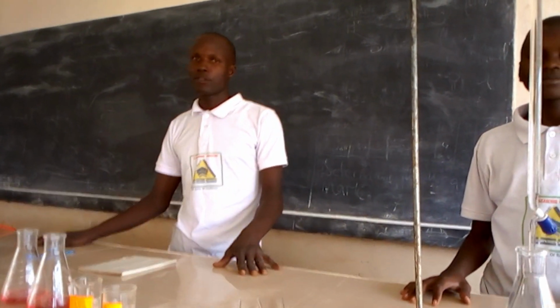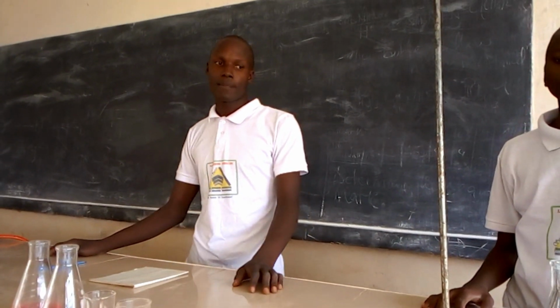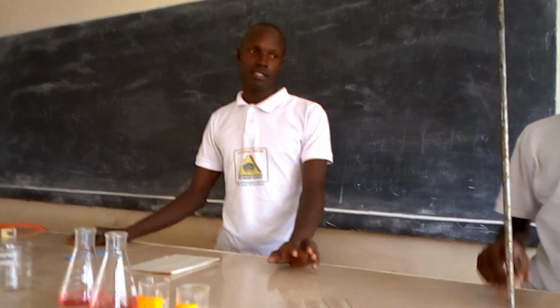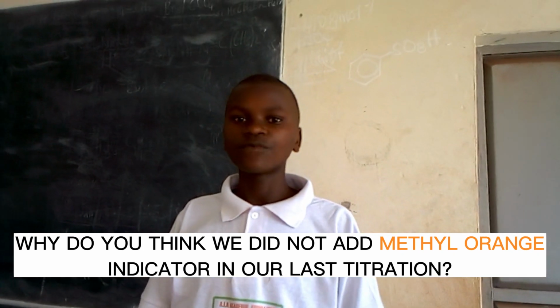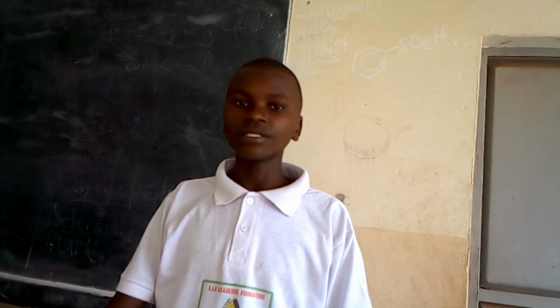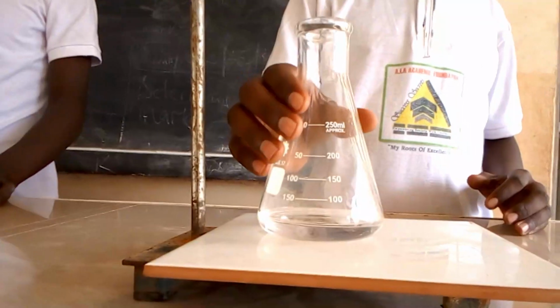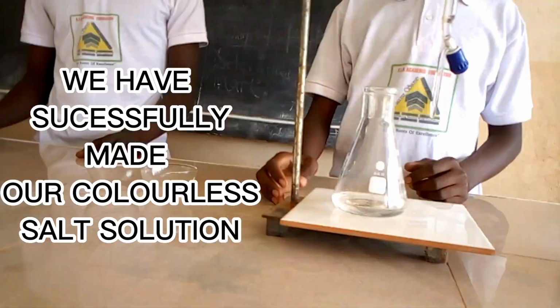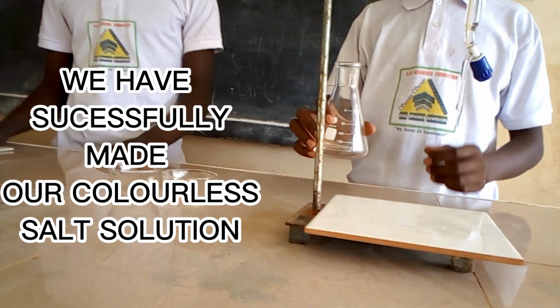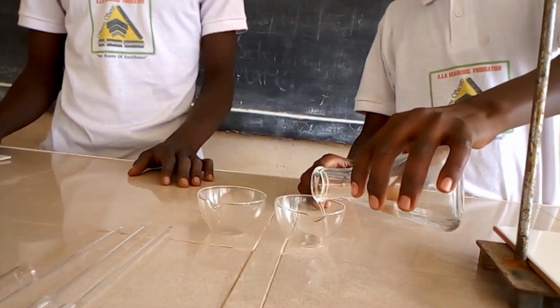We are sure that 33.4 cubic centimeters of the acid is enough for the base in the conical flask. We have already added 33.4 of the acid to the sodium hydroxide, so that they can be of the same equal range. Our solution is colorless because we did not add the indicator. So we shall transfer our titration solution into the evaporating dishes so that they can be heated.